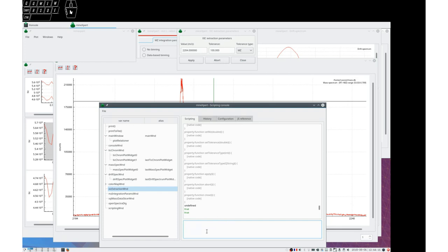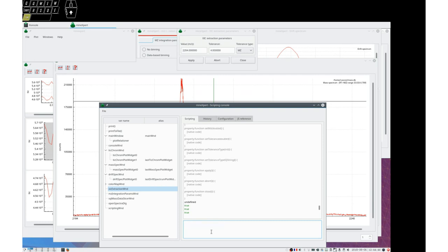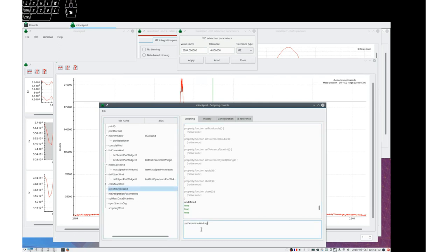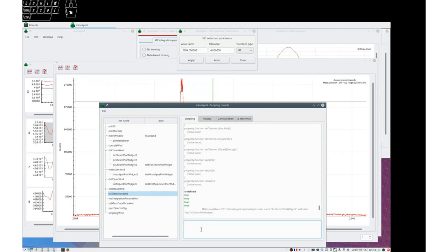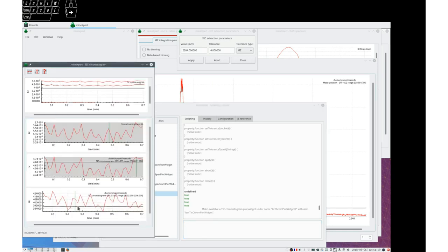It's there. And then set the tolerance to two MZ units. Or let's say four. So we have two on the left and two on the right. And you see that it displays here. And then we know we have an apply function. So let's call that apply function.